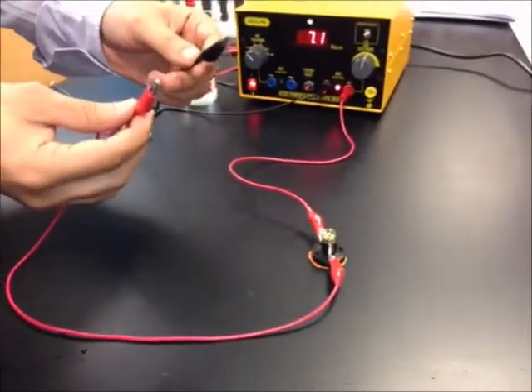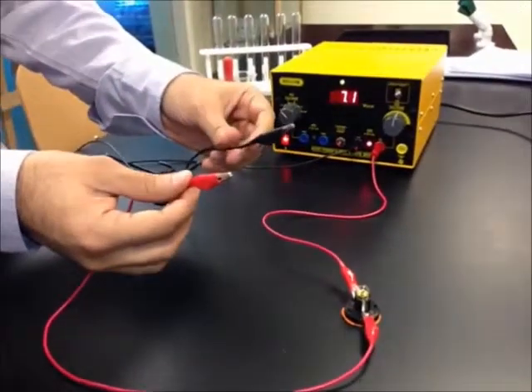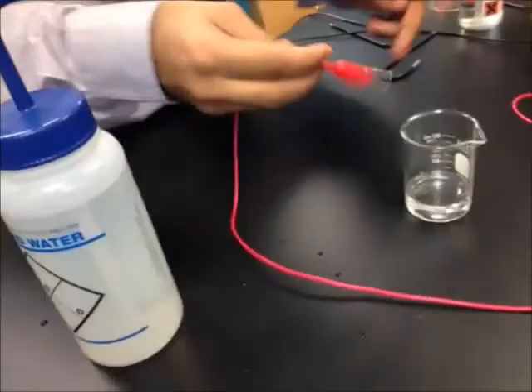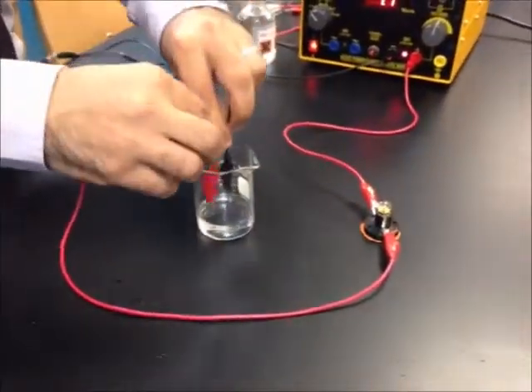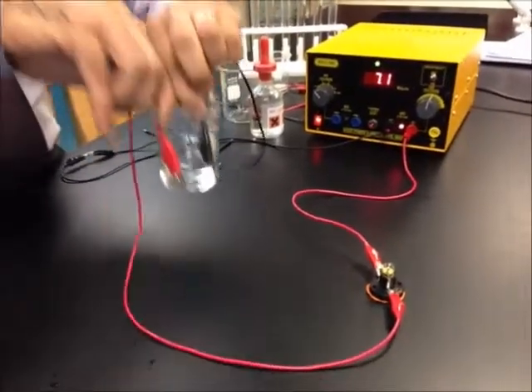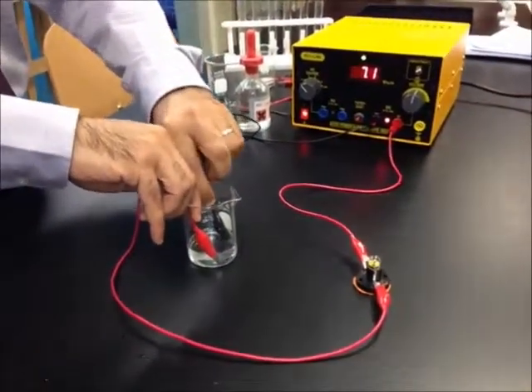Now I'm going to dip these two electrodes in water to check if water conducts electricity or not. As you can see, there is no light.